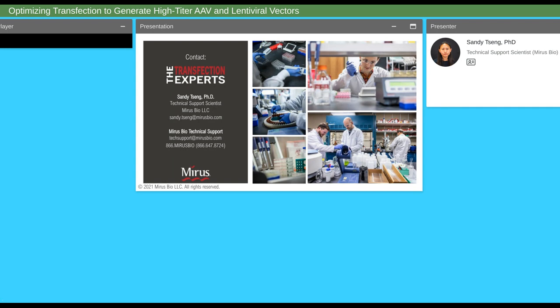Yeah, sure. So I kind of went over that in the presentation already. I mentioned that for the AAV2 that we've been producing the most in-house here at Mirus, we've been using HT1080 cells. A functional titering method essentially is trying to measure how much of the sample can infect a target cell.